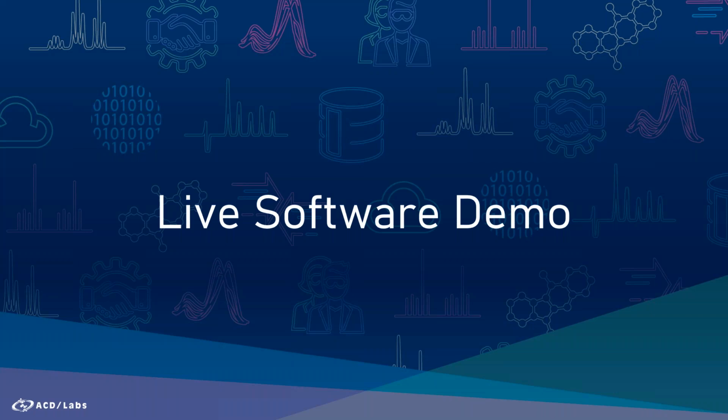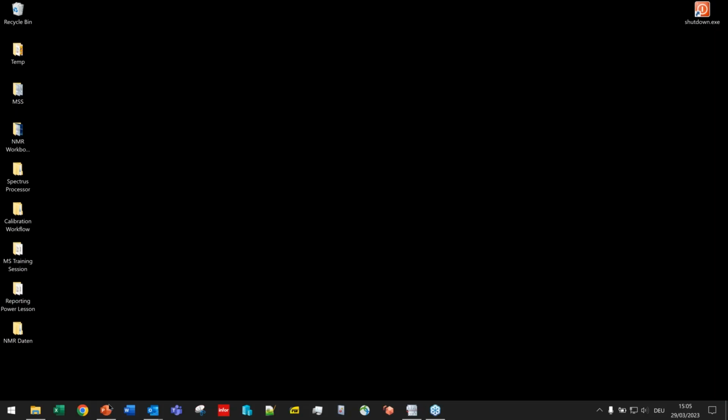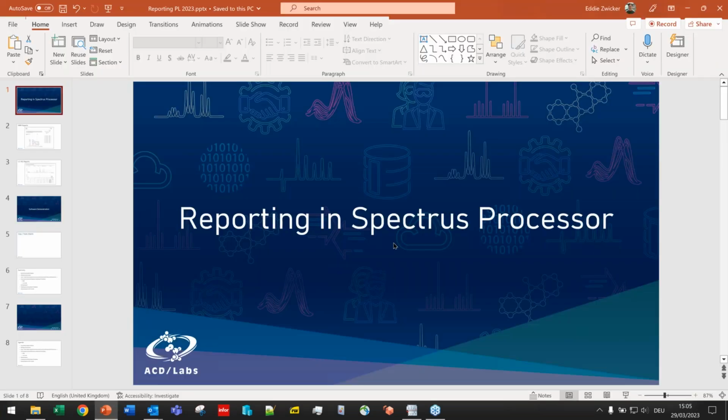All right, so okay, here. So I'm gonna here. So here you go. See my screen now, Allison? Yes, I see your PowerPoint.